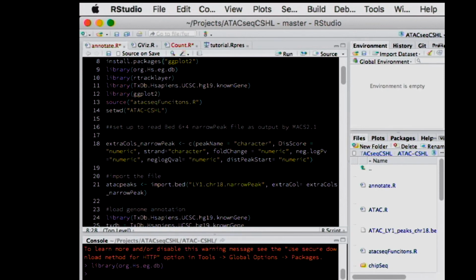So you can use sort of any DNA aligner. I've been using BWA. So it's a typical paired-end analysis. You sort of take the FASTQ files for read 1 and read 2, and then align each separately, and then you do a step to bring them together. And you end up with reads that represent areas of open chromatin. Right?